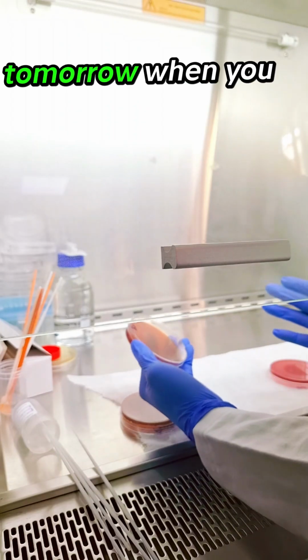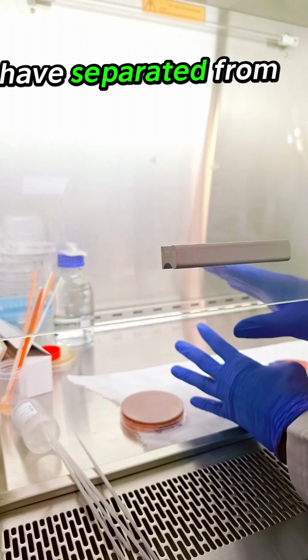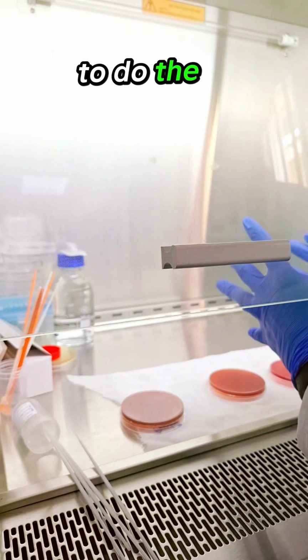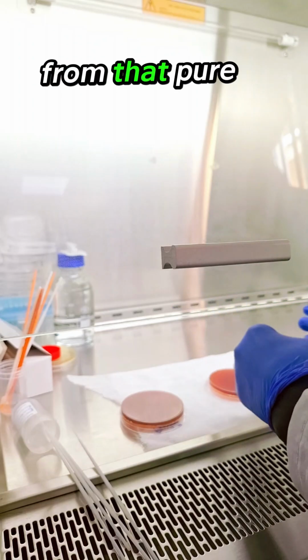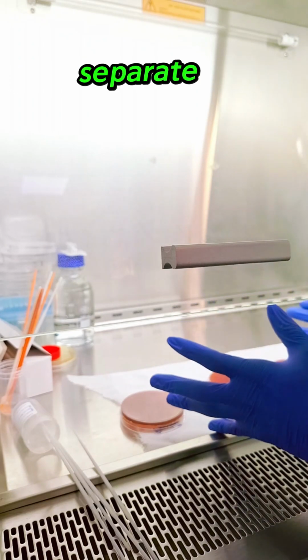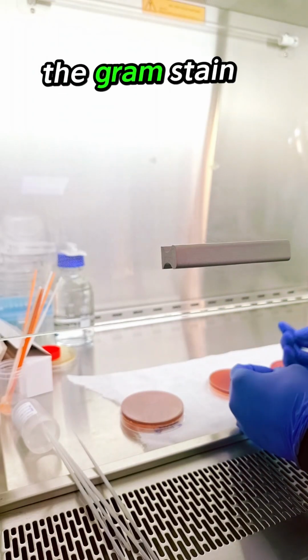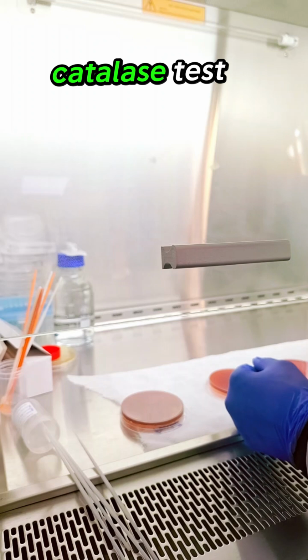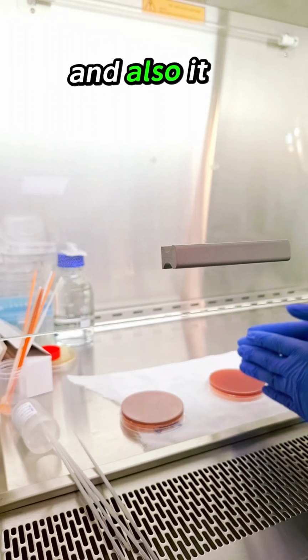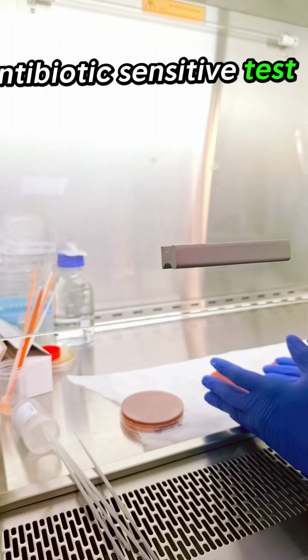For that case, tomorrow when you come and see the result here, you will see that these bacteria have separated from each other. And you'll be able to do the gram stain from that pure culture, pure colonies, after you've obtained them. After the bacteria separate and you obtain the pure colonies, you are able to do the gram stain, the catalase test, and every other biochemical test, of course. It will also help you to do the antibiotic sensitivity test.